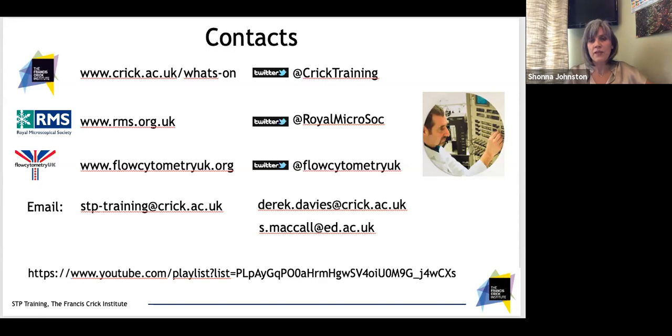I think you just have to be careful. If you've got something that's already working on a filter-based system, it obviously depends where you are in your projects. We have quite a few people who are quite far on in their projects and don't want to move across to a spectral system because the data was going to be quite different for them. So obviously they wanted to continue on with using the LSR, which was absolutely fine. And the biggest drawback that we actually have is that we don't have a matched sorter. I think that will make such a massive difference to people if they'll be able to do some matched sorting, so have an instrument that's actually matched to the Cytek Aurora that we can actually do some sorting with. But aside from that, it's really easy.